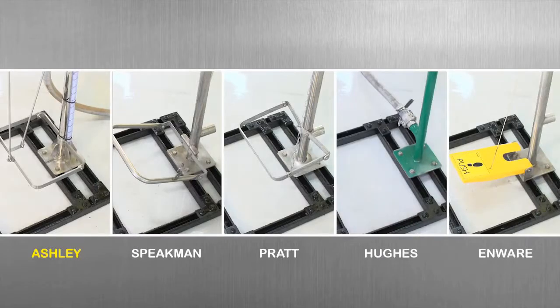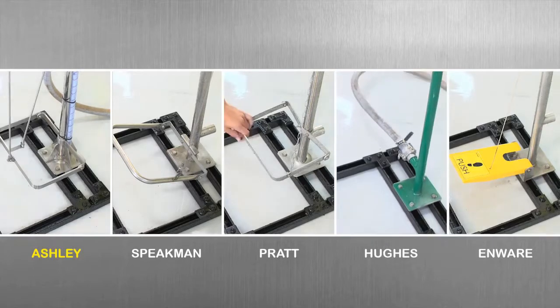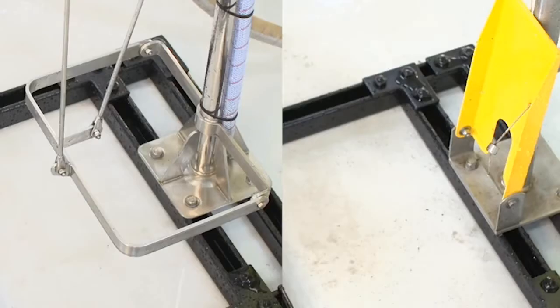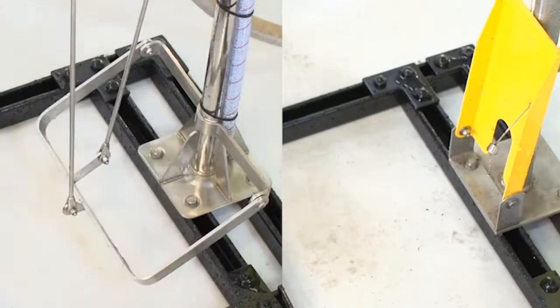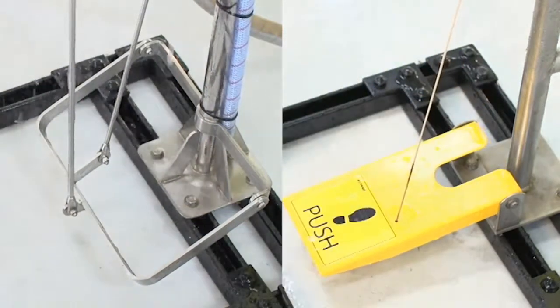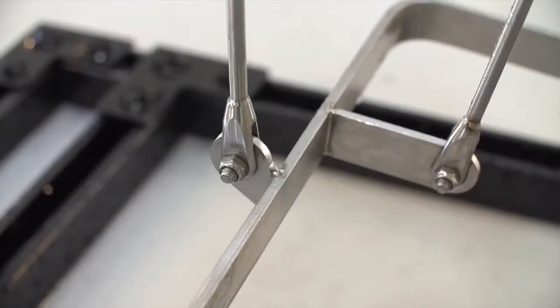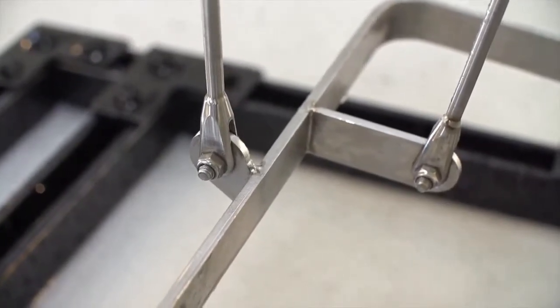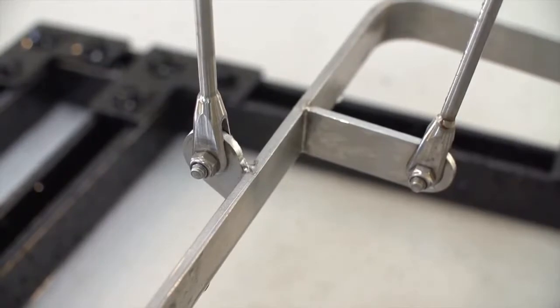We'll begin at the base of the units with the foot pedal. If you compare Ashley's with other foot pedal designs, you'll notice we don't use chains or keyring connectors, and everything is welded to solid 316 stainless steel rod. The unique aircraft fork design delivers maximum strength and reliability through the foot pedal activation rod.